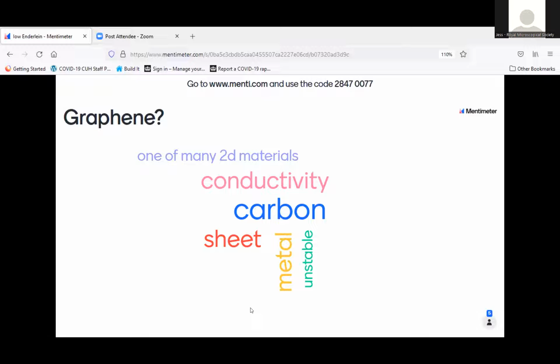The problem why we did not publish yet is that we still are fighting with the model, because what we see is that the diffusion behavior is much more complex than we expected. We see also some very interesting coupling of diffusion between leaflets, which is not so simple to explain. This is the only reason why we still did not submit it. But the method works.